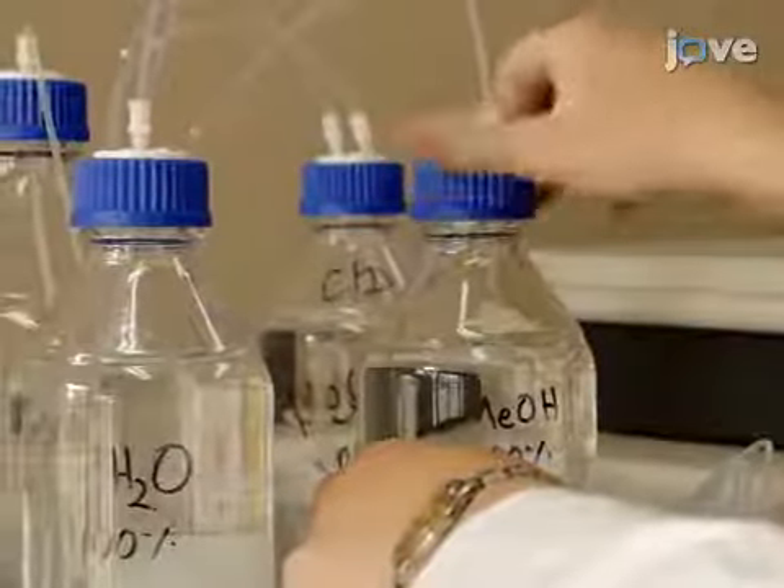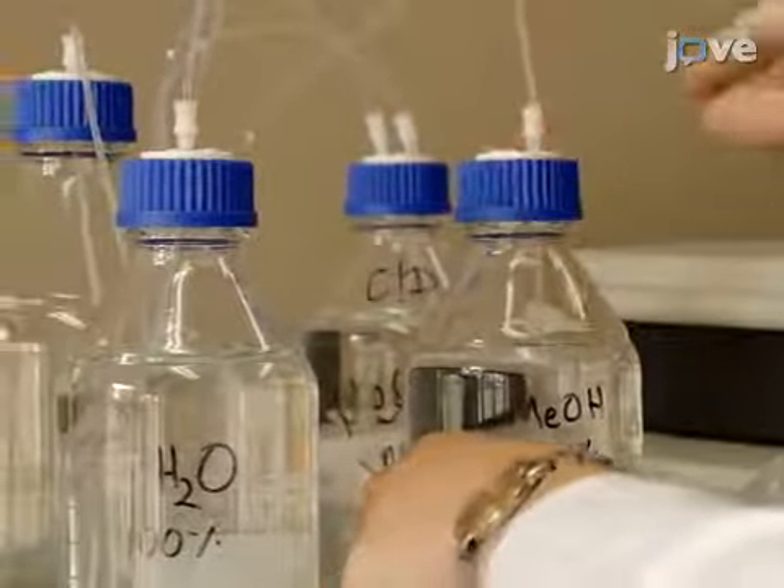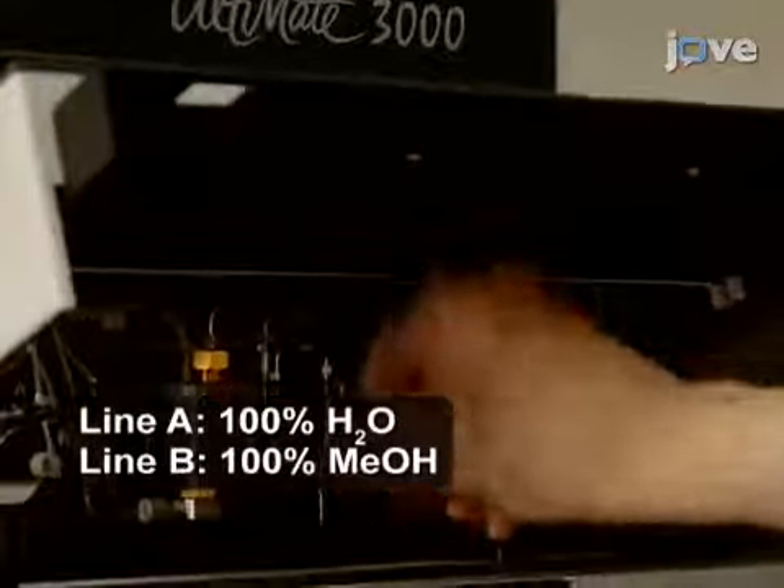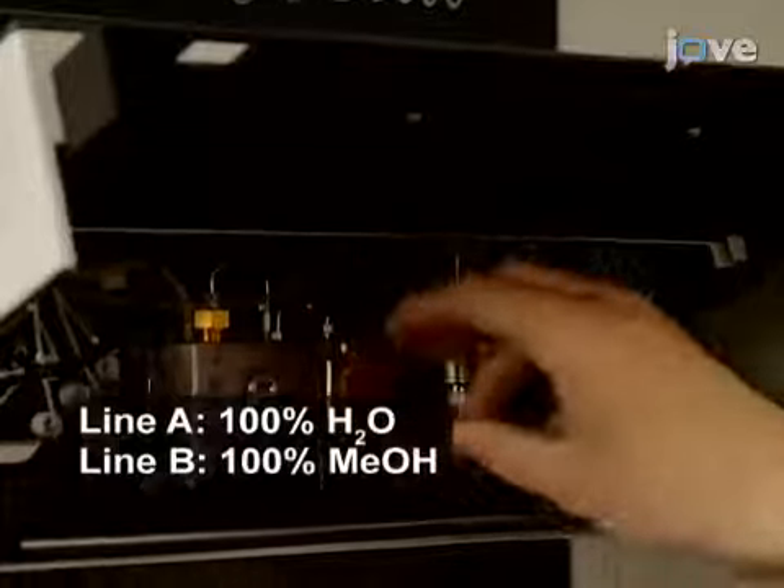To begin this procedure, prepare the HPLC instrument with 100% water on line A and 100% methanol on line B as the mobile phase, purging the pumps as per the manufacturer's requirements.